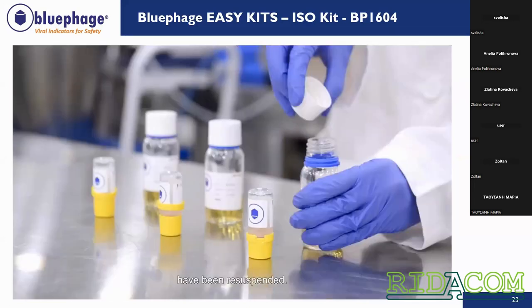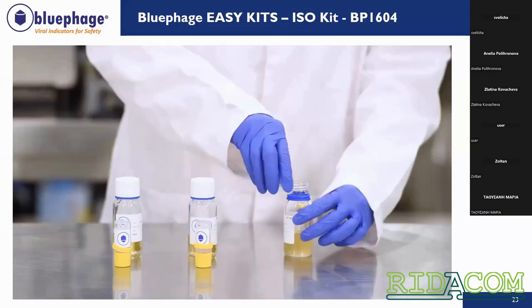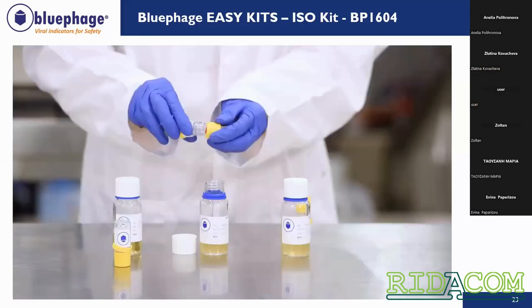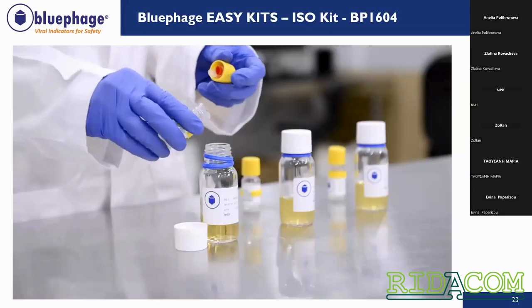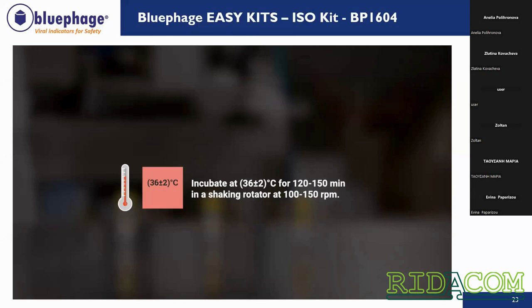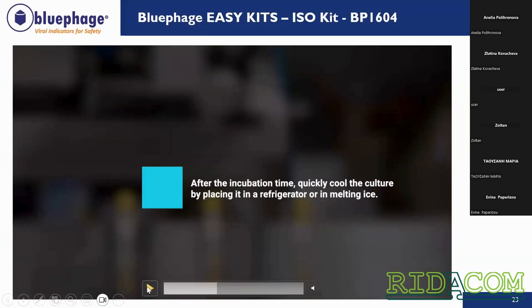After that, once we see our E. coli is turbid, we pour all the content into our MSB bottle. Once that is done, we put it in the incubator for 2 and a half hours at 36 degrees, shaking manually or with an automatic shaking rotator at 100 RPM. The same as before, if we are going to use the inoculant culture straight away, we don't need to cool it. But if we are going to use it later, even 30 minutes or an hour later, the culture must be cooled quickly in a refrigerator or melting ice.